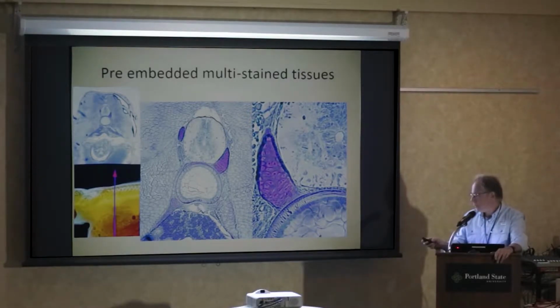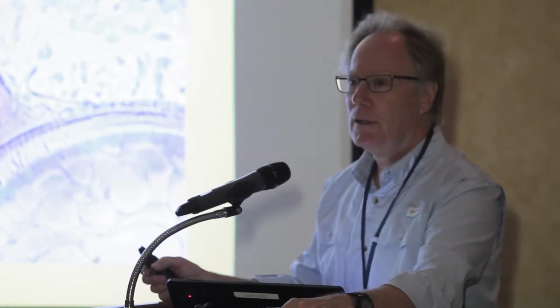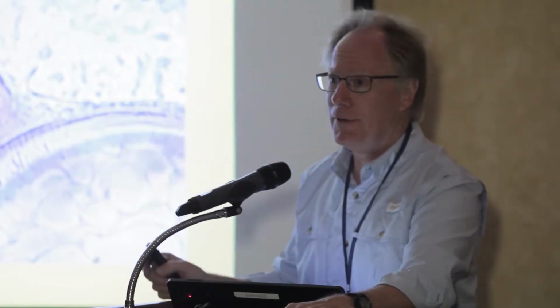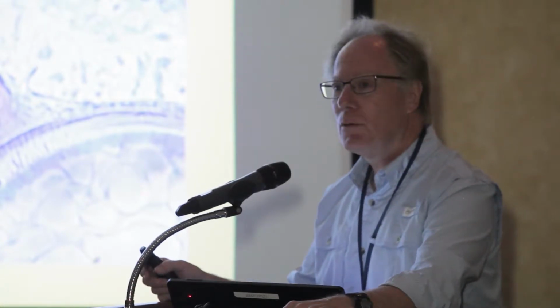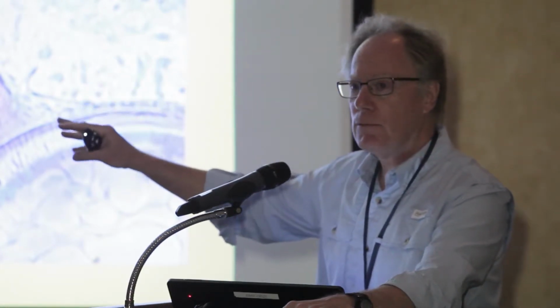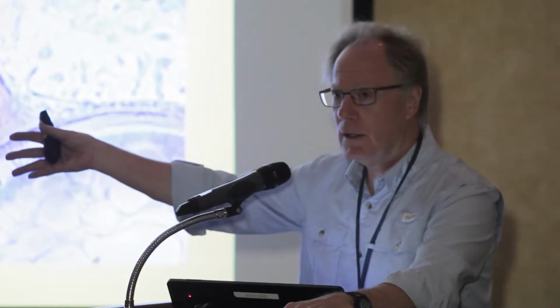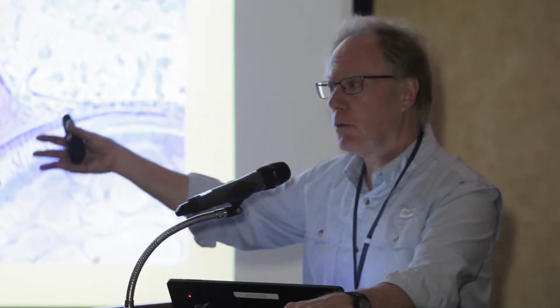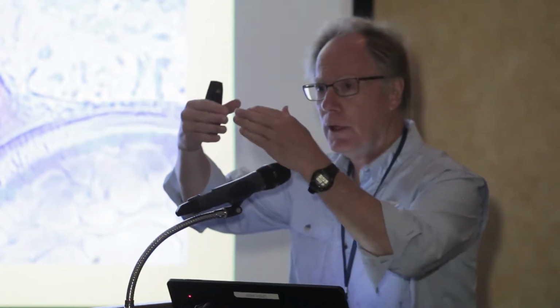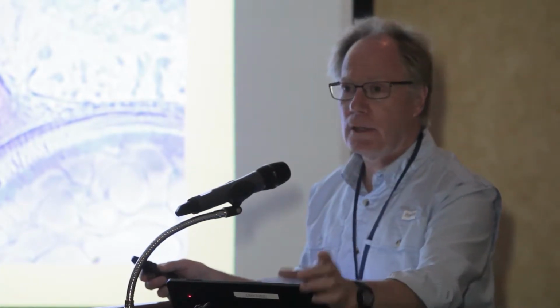Therein, I usually like to stop, and I don't want to insult anybody's intelligence here. But I usually walk my students through a visualization exercise to remind them where this comes from and the importance of genes in this entire process, and therefore that's why we're looking at a Giemsa stain for the DNA action, and that's why we're looking at something like a May-Grunwald for different types of tissue based on the nature of the cytoplasm. I happen to start with a ping pong ball, and I say consider that an ovum.